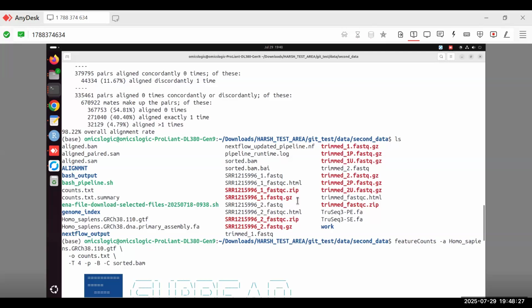Yes, hello. Yes, Ravindra. After getting this output file, count matrix, what else can we do? The graphs and all things. From the count matrix, like we did it for just one sample, when you have it for the entire project that you are performing, you can have the differential gene expression analysis. You can have the statistical tests like ANOVA, t-test, chi-square test applied in order to understand the differential gene expression analysis here.